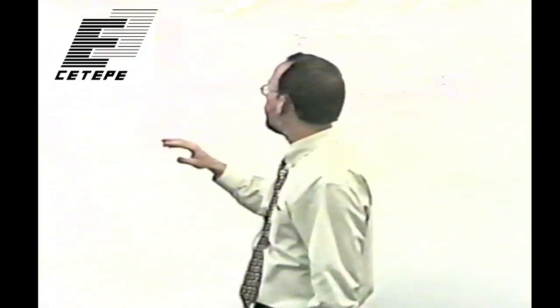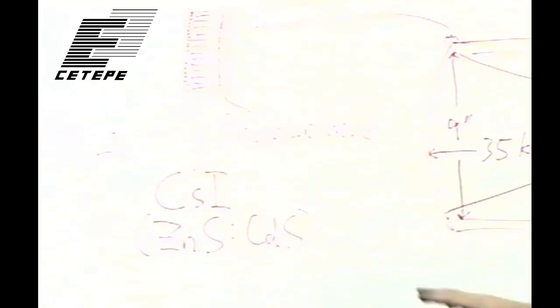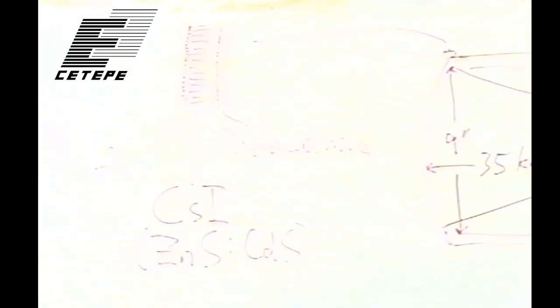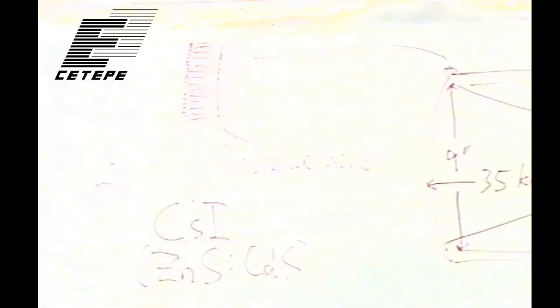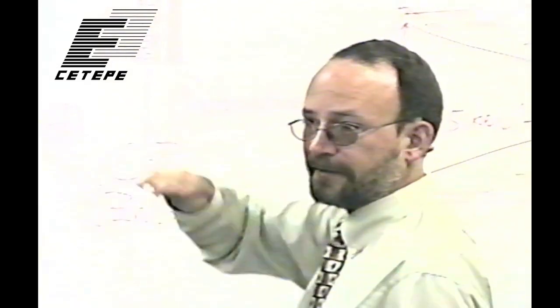And on the front, they first have a protective aluminum layer to protect this cesium iodide scintillator here. We were talking yesterday about how you can grow these. What I've tried to indicate here is that these are an array of single crystal columnar scintillators made out of cesium iodide. This has replaced the earlier scintillators, which were zinc sulfide, cadmium sulfide. It's a much more efficient scintillator, and it has these collimating properties that we mentioned. In other words, once the light gets excited in the crystal, it tends to not spread to adjacent crystals, but reflect right down the fiber.